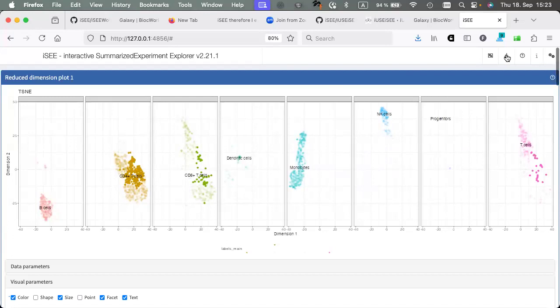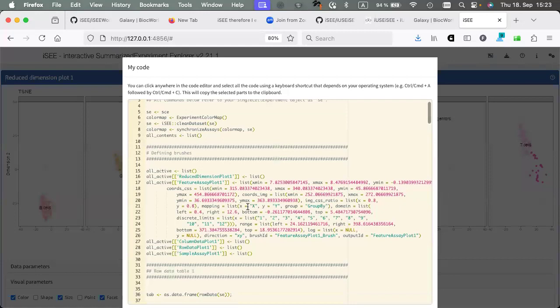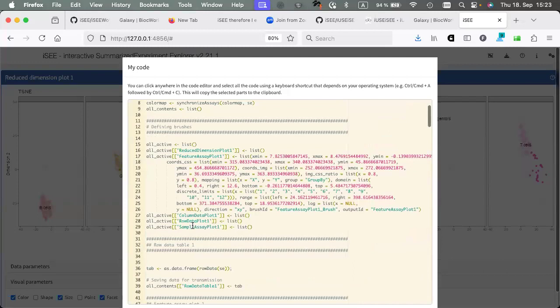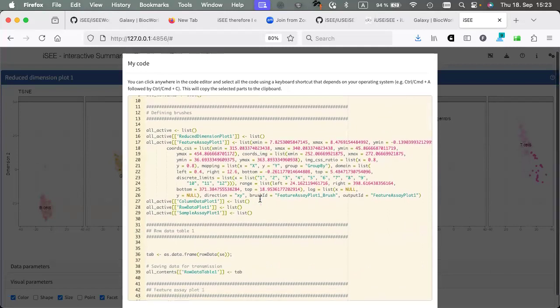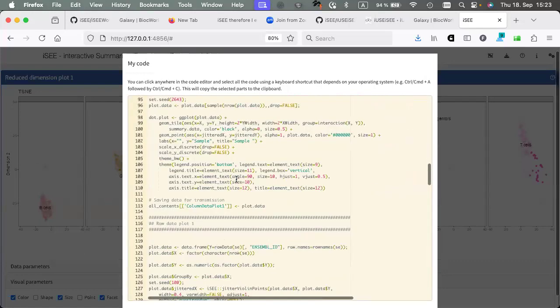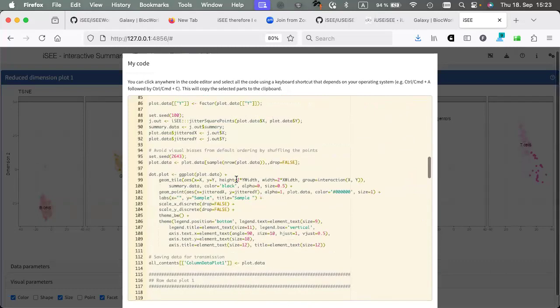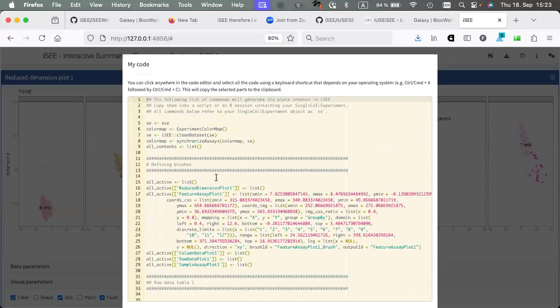Again, if we click now on extract the R code, this thing will also have the option for faceting this. So the facet is coming. Let me just see. There has to be somewhere some facet. I cannot find it. Yeah. The brush, no? Where's that? Is it coming later? Up, no? Yeah, that's true. I could actually even change it, but I can Control F and say facet.